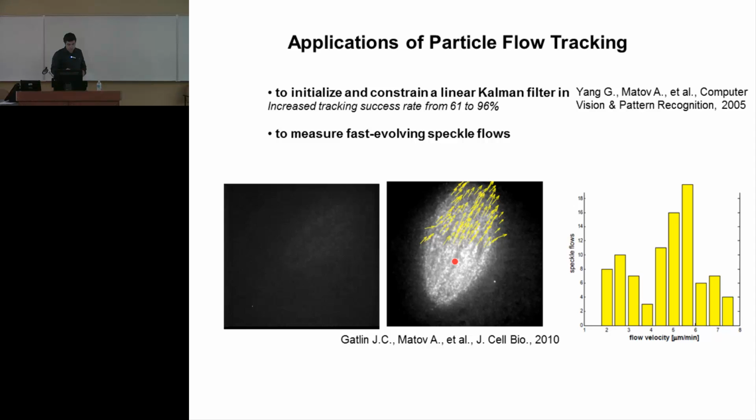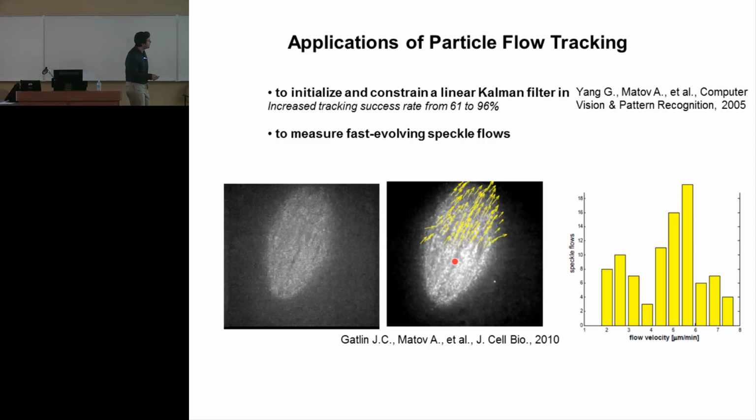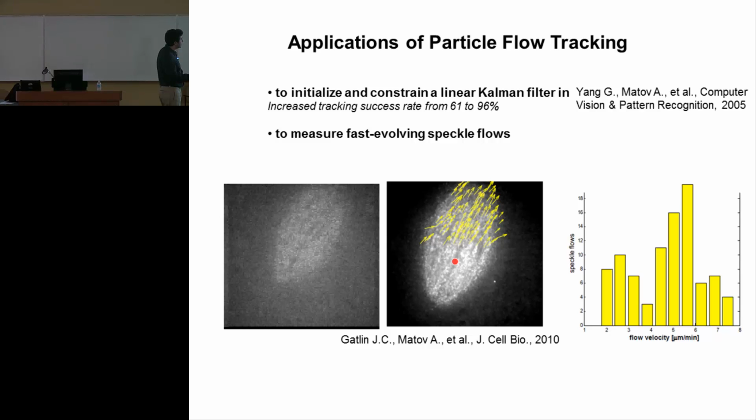Another application was to study these very fast evolving structures, again, this mitotic spindle. What we see in the movie here is a mitotic spindle again, skewered by a needle. There is a needle here, and the spindle is just avoiding and leaving this needle. You can see how it's going to start again. So this structure is highly dynamic and changes the direction of motion, so it's very hard to track. Plus there is anti-parallel motion.